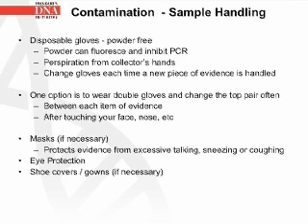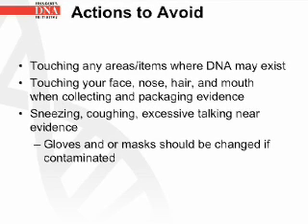Masks protect the evidence from excessive talking, sneezing, or coughing. Also, eye protection, shoe covers, and gowns can also be used. Actions to avoid when handling evidence: touching any areas or items where DNA may exist, touching your face, nose, hair, and mouth when collecting and packaging evidence, sneezing, coughing, and excessive talking near the evidence. Gloves and/or masks should be changed if contaminated.